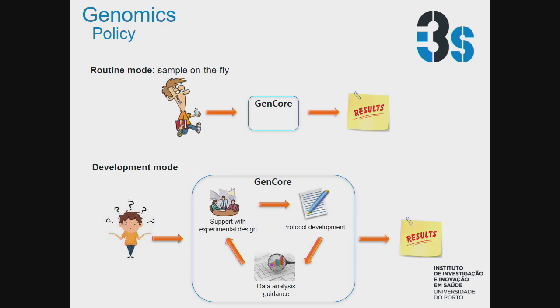So we have two modes of approaching our platform. We have the routine mode, which we call sample on the fly. Sometimes you are as happy as that guy there. You know exactly what you want to do. You just bring your sample to our facility, we process it, and we give you the results.